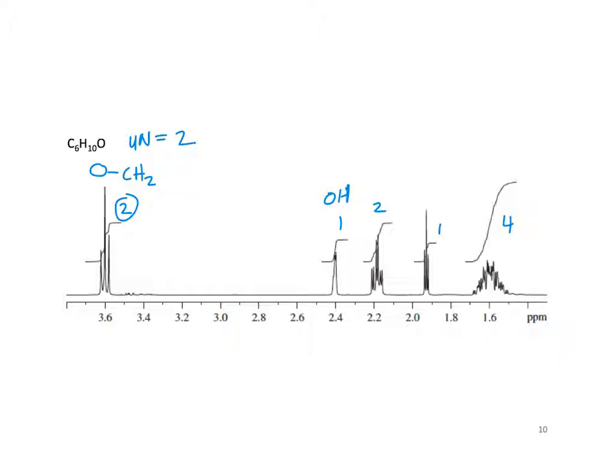Is the one all the way on the left at 3.6 connected to the triplet at 1.9? Do those coupling constants look like they match?